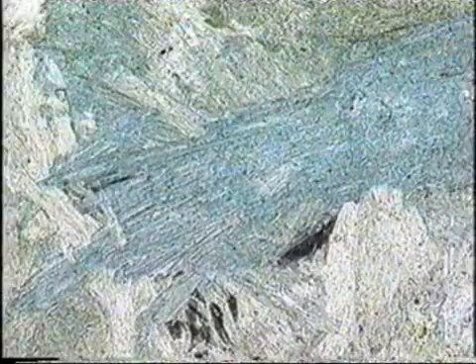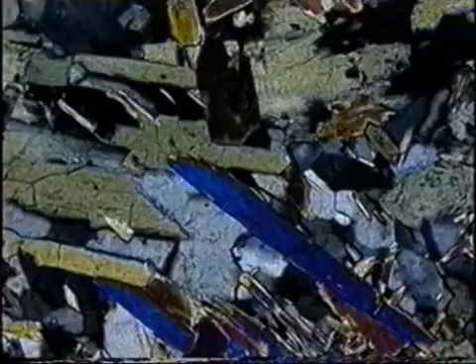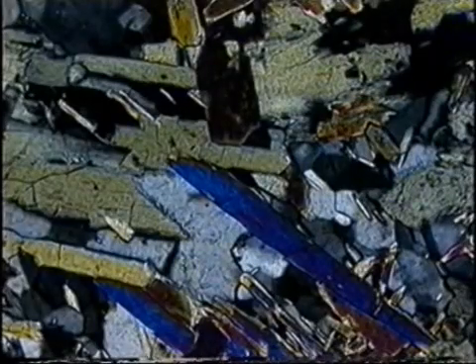Hornblende varies widely in texture and colour, from pale and fibrous to darker and granular, to bluish green and darker bluish green, to brownish green, and to dark greenish brown. These darker colours mask the interference colours. Prismatic form is common, but aggregates vary and can be fibrous and subradiating.